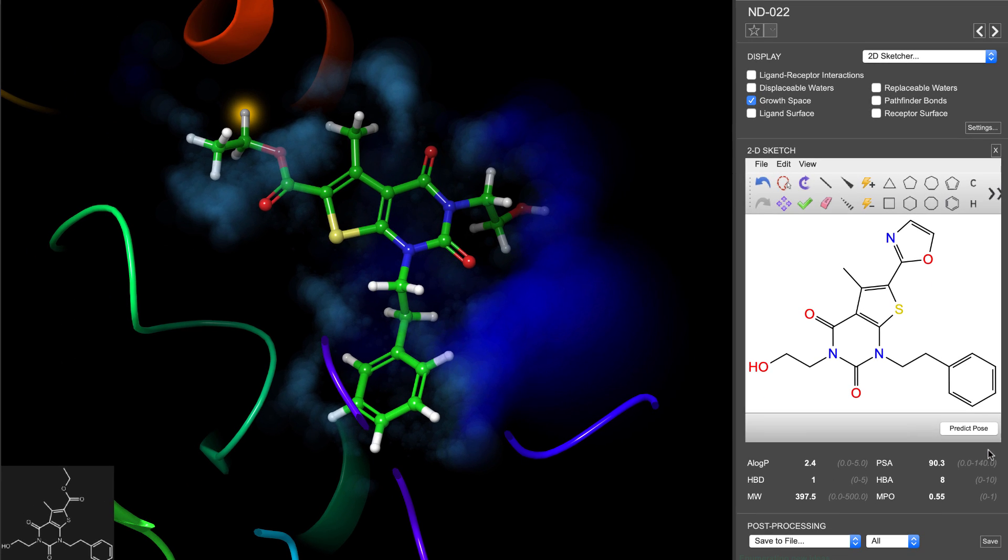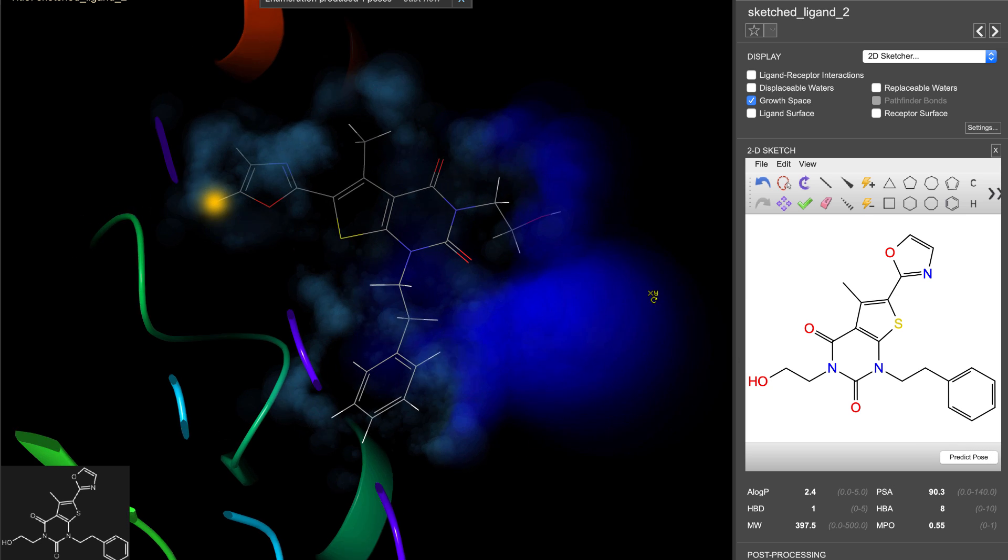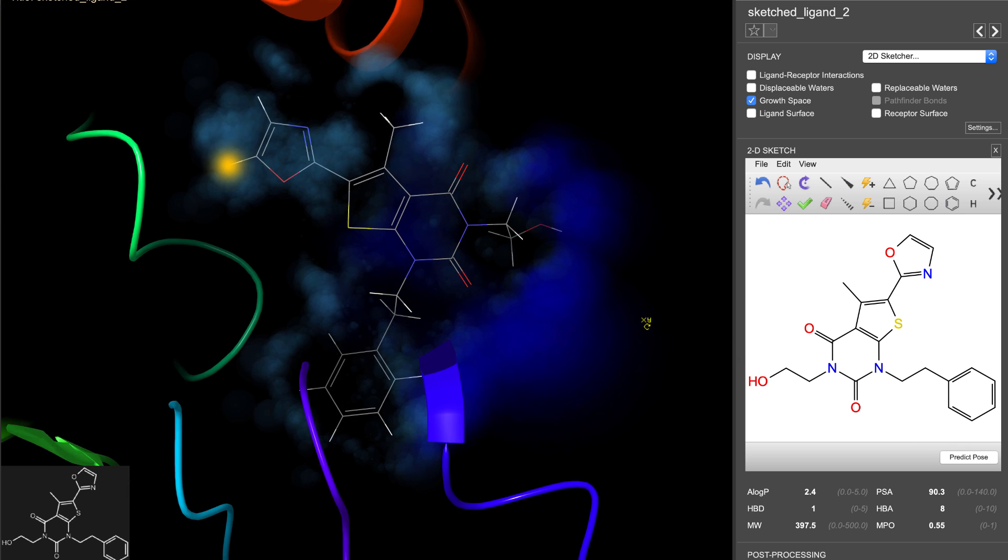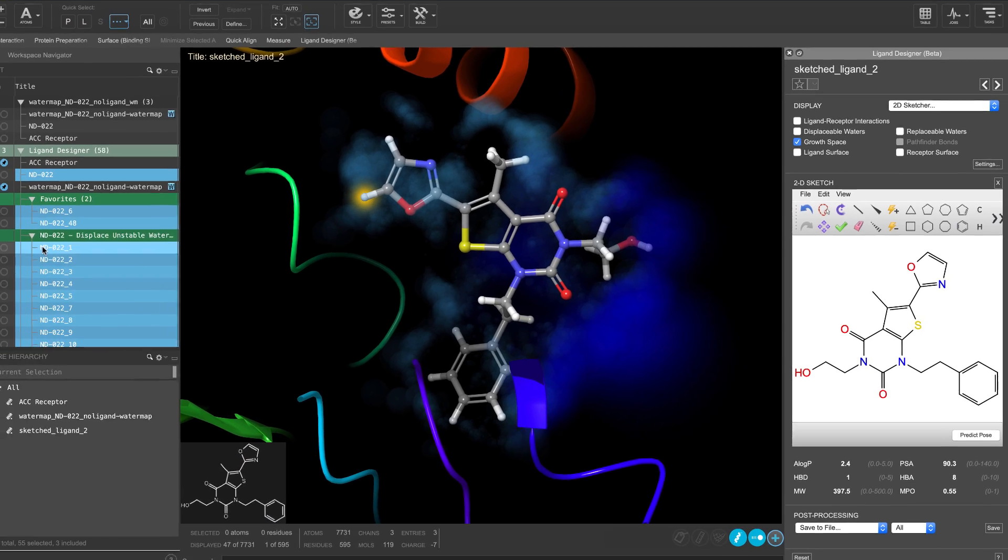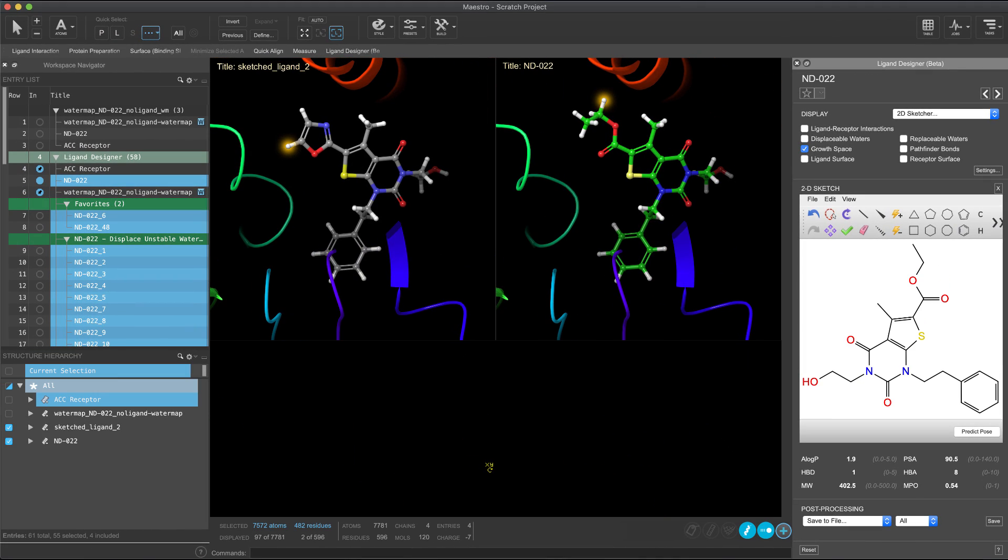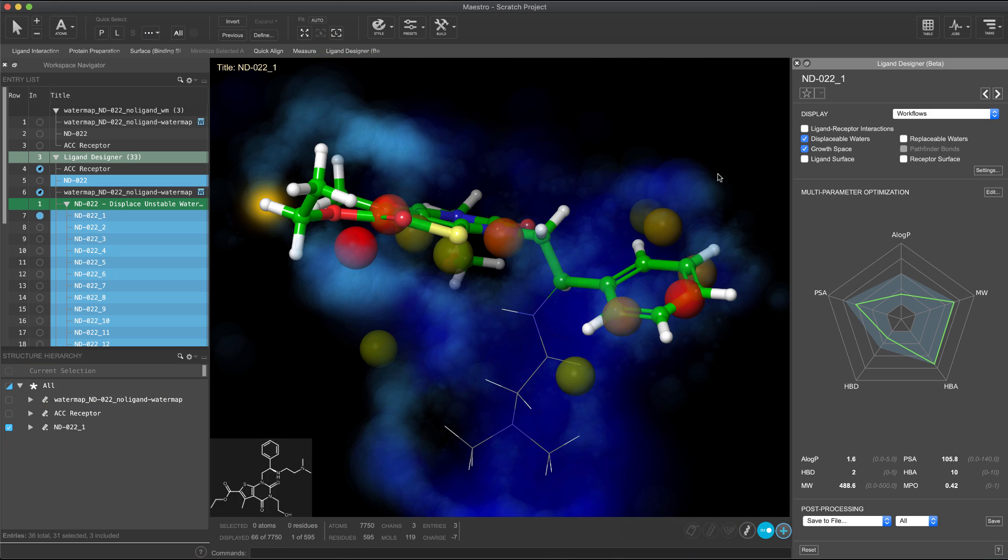This workflow is certainly far more superior than manual minimization in binding sites as it captures ortho and meta preferences and roughly adjusts for protein flexibility by van der Waals scaling.